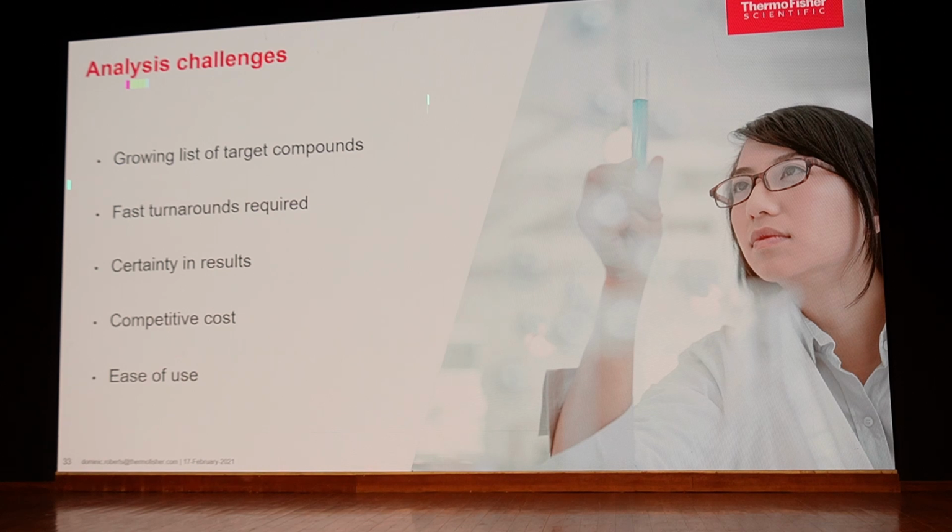You can search the same acquired data for another untargeted or non-target analysis, where you can try to find hidden impurities and hidden metabolites which are not part of your target list. That is the best approach you can easily achieve through HRMS.